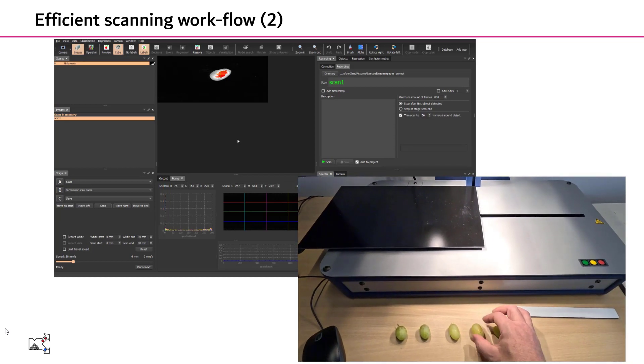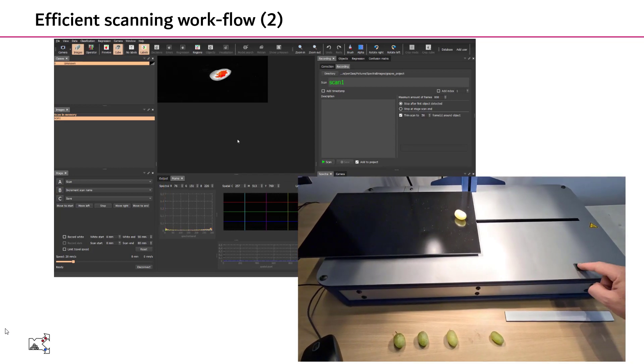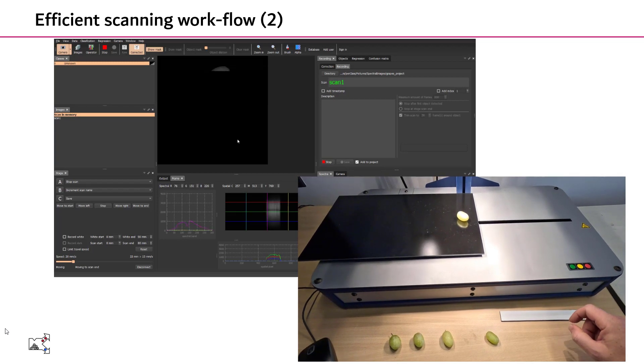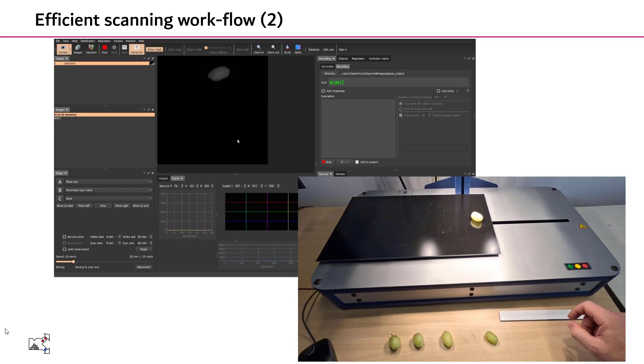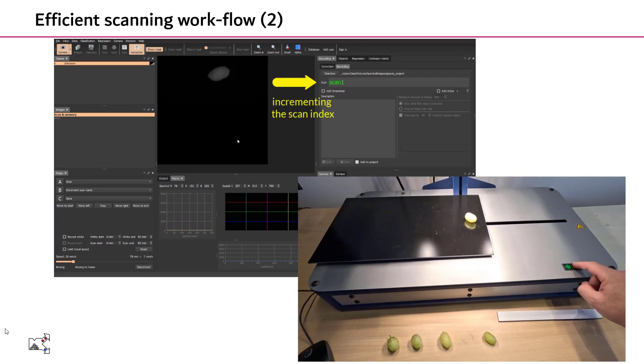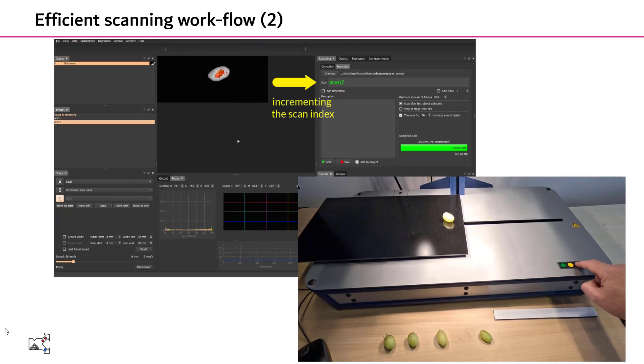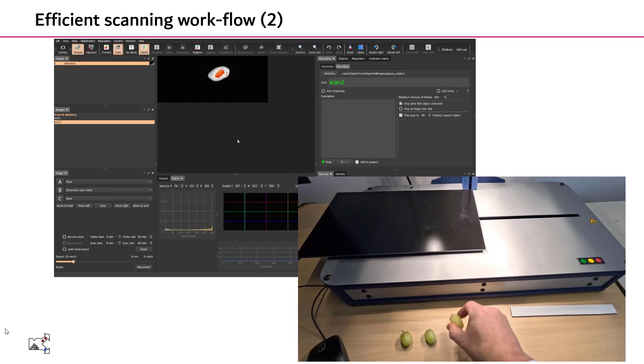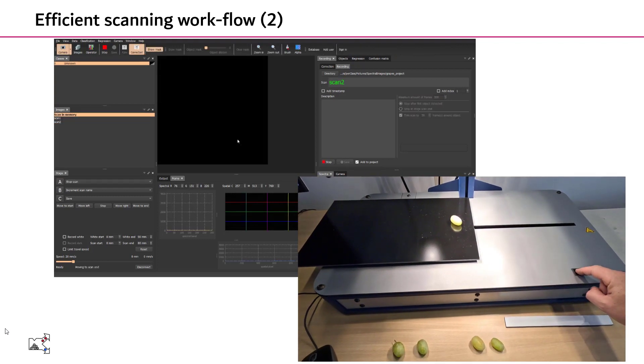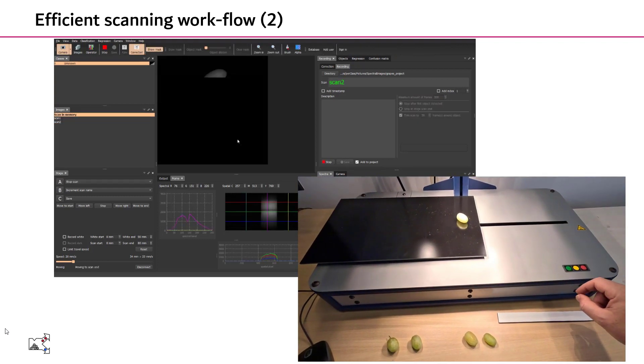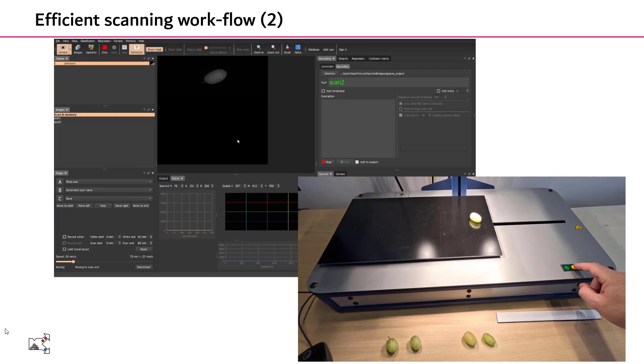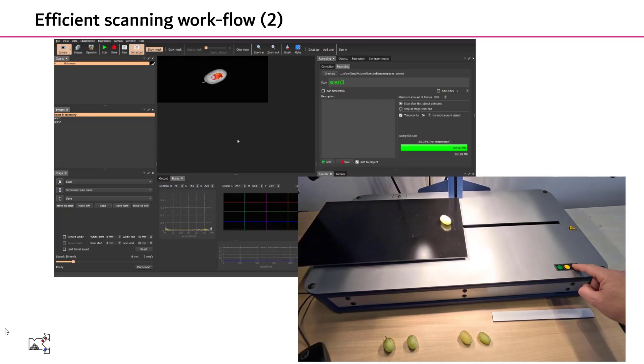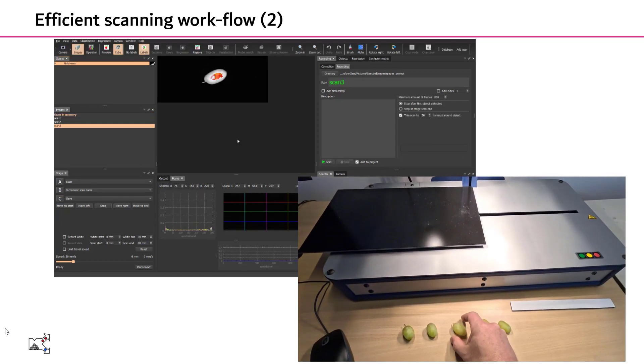We put another object. Press the green button to scan. Now we press the yellow to increment the scan counter and the red to save. You see the process is very simple. Put an object, scan with green, increment with yellow, save with red.